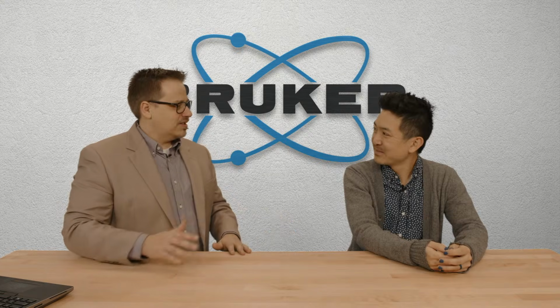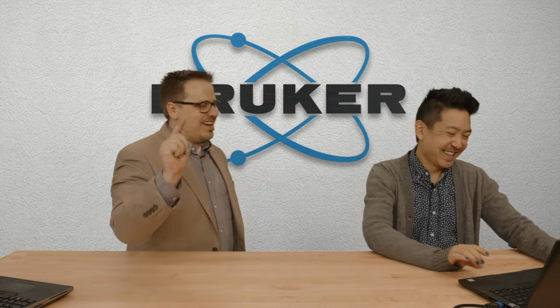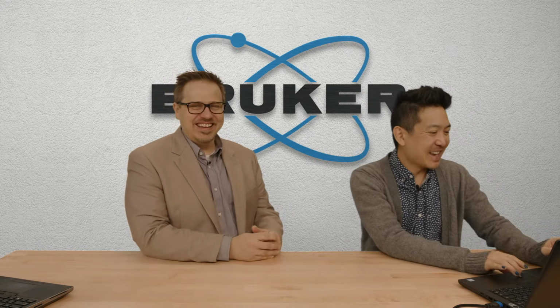I think we are ready to see it in action, so let me grab my laptop real quick. So. All right, well, okay, Nate, so you're going to fire up a video of this, right? So it all goes smooth. No, we are doing live on the air. So we're going to put not only the program to the test, but we're putting Nate to the test. And we're putting my version of Windows, which I haven't updated in a couple of weeks, to the test. So hopefully we don't have any. Let's see if IT shuts us down.